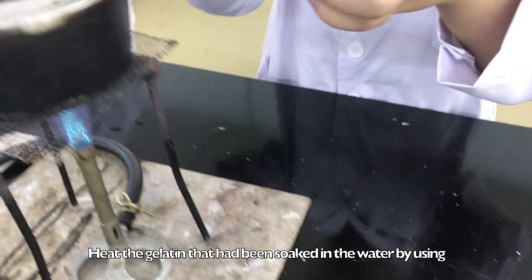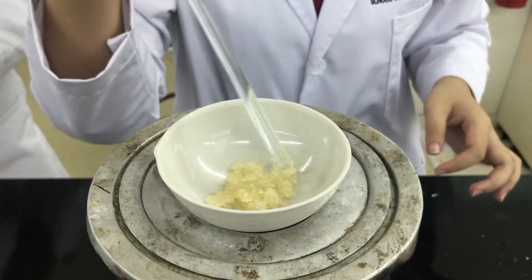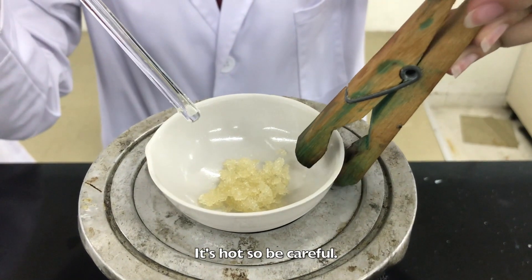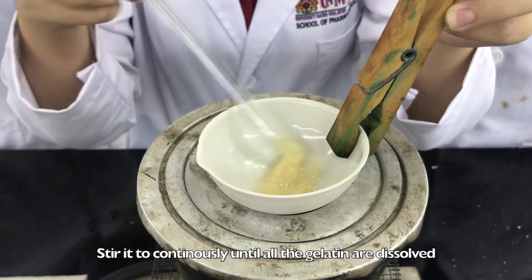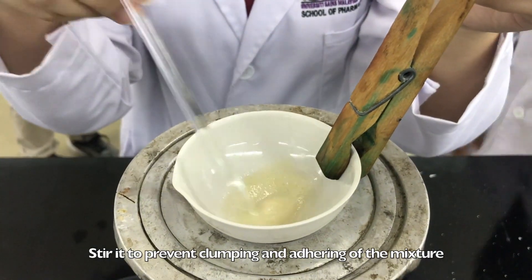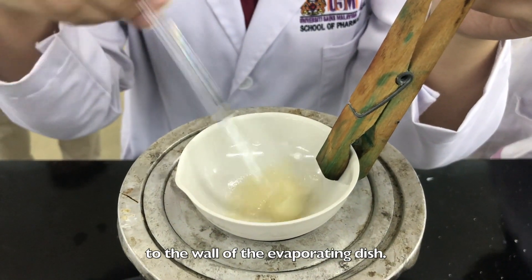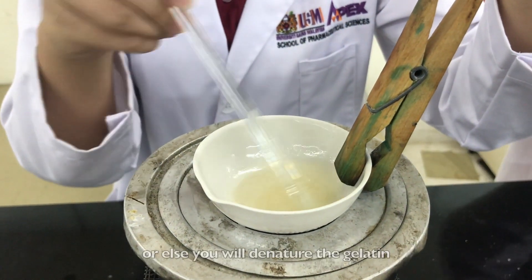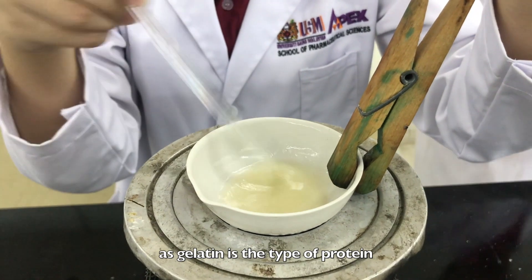Heat the gelatin that had been soaked in the water by using a water bath, and stir it continuously. It's hot, so be careful. Stir continuously until all the gelatin is dissolved, to prevent the clumping and adhering of the mixture to the wall of the evaporating dish. Remember to stop heating once the gelatin has dissolved, or else you will denature the gelatin, as gelatin is a type of protein.